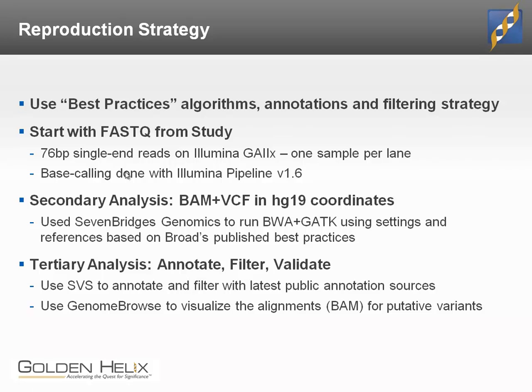Okay, so let's talk about how we would, pretty much in any study looking for a rare, potentially highly penetrant variant, what would be common best practices ways of going about that. First, you need to pick an alignment and variant calling strategy that reflects best practices. And so what we did here was use BWA and GATK. We ran that pipeline, which has a lot of intricacies to setting up.